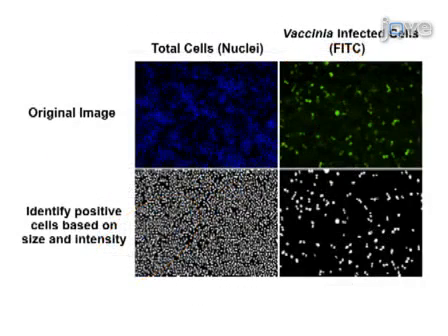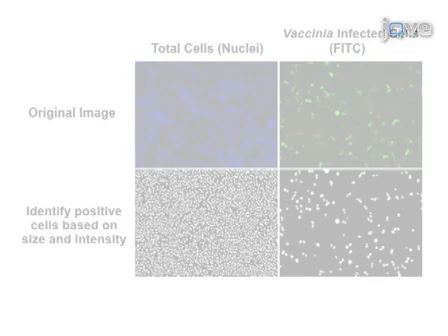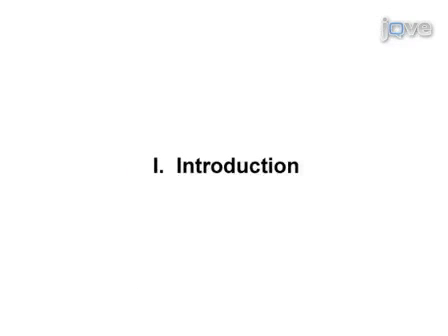Ultimately, results can be obtained that show changes in infection through quantification of the percentage of infected cells using immunofluorescence microscopy. This allows for the discovery of novel cellular factors involved in viral infection. Though this method can provide insight into virus-host interactions, it can also be applied to the study of any system that would benefit from using a visual readout of the cellular process of interest.